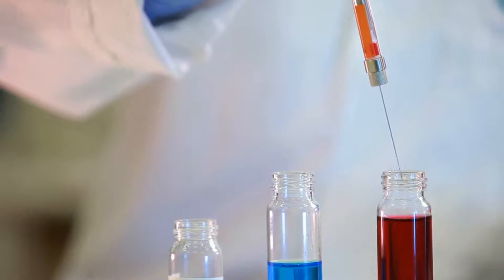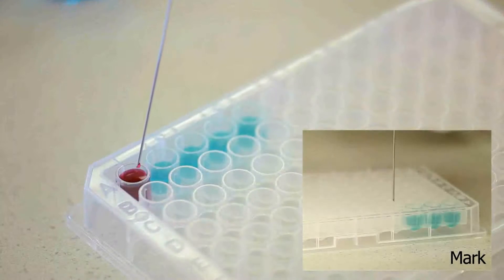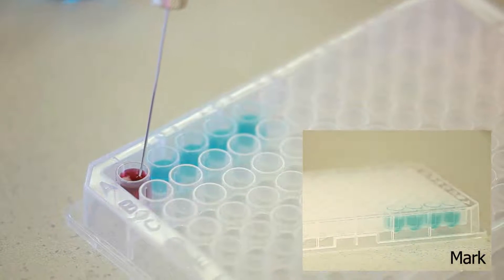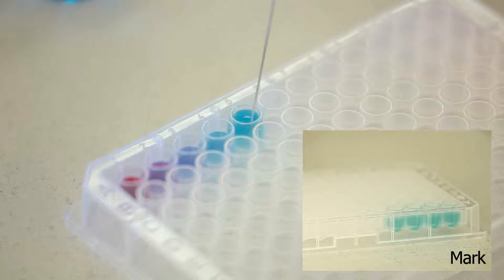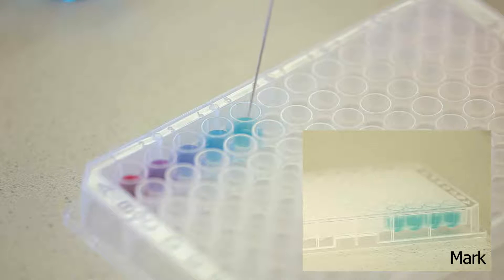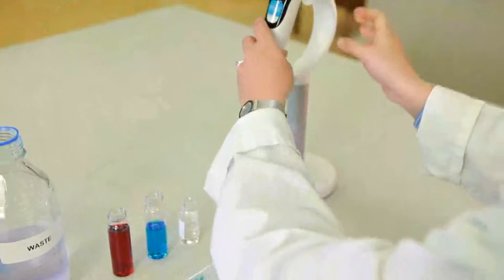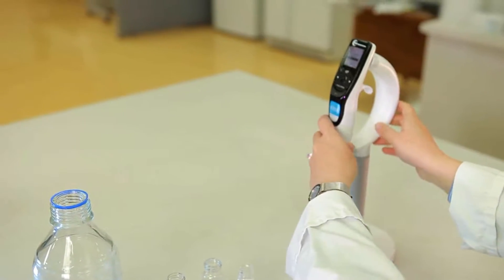The new solution needs to be mixed, so Catherine selects the mix operation, the mix volume, and the number of mix cycles. Then, Catherine dispenses the new solution. And that's it! Now Catherine is moving on to her next task.